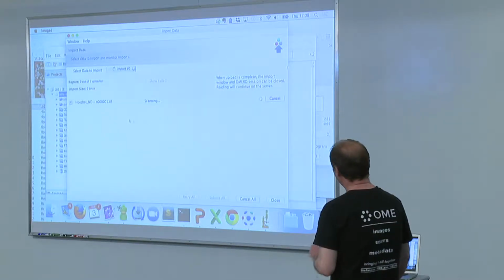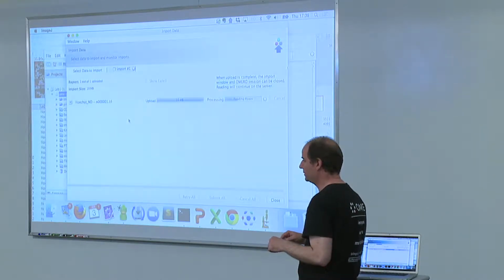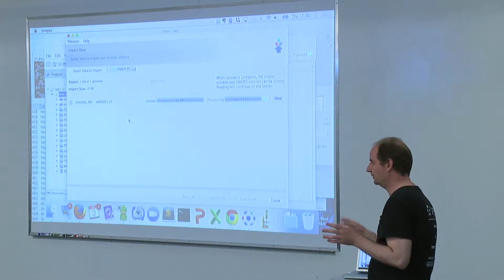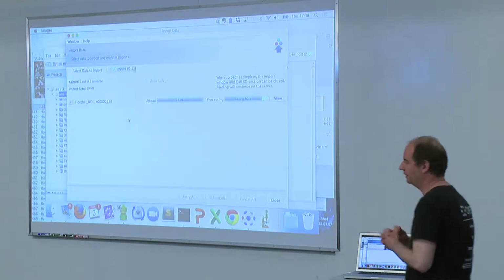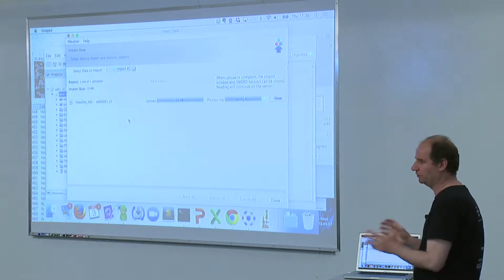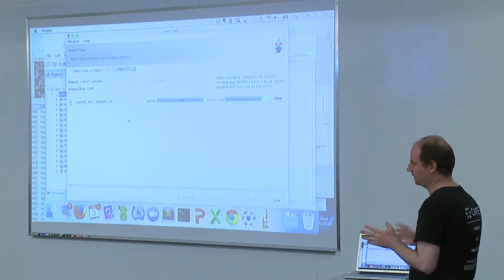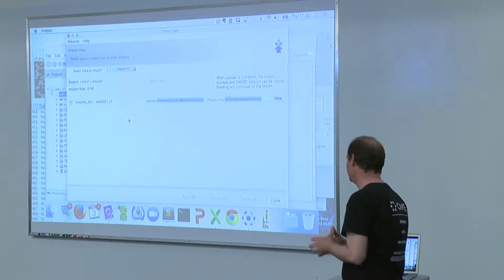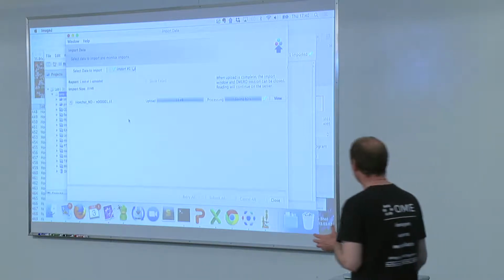In this manner, the image will be imported to OMERO with the regions of interest associated with the image, as well as the table of results which I showed you, which will be imported in the CSV format and attached as an attachment to this image on the OMERO server. So if you, as I'm sure you would as a scientist, get into doubt about which data belong to which image, this is the answer to the question.